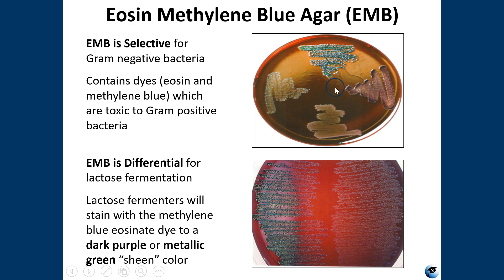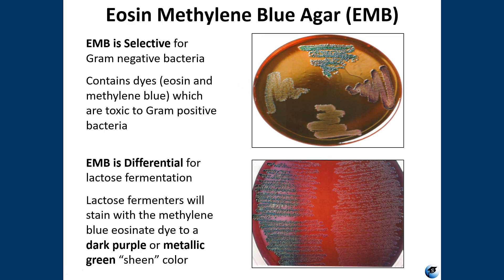This figure shows EMB inoculated with two coliforms — coliform one, coliform two — and then a gram-negative non-coliform and a gram-positive organism. Note the green and purple colors, which means these two are fermenting lactose. They're all growing pretty well, but if you look closely, the gram-positive species does look like it's struggling a little bit. This would be a case where you'd have to compare that species' growth on this media to how it grows on a general growth media to determine if it's gram-positive or gram-negative.